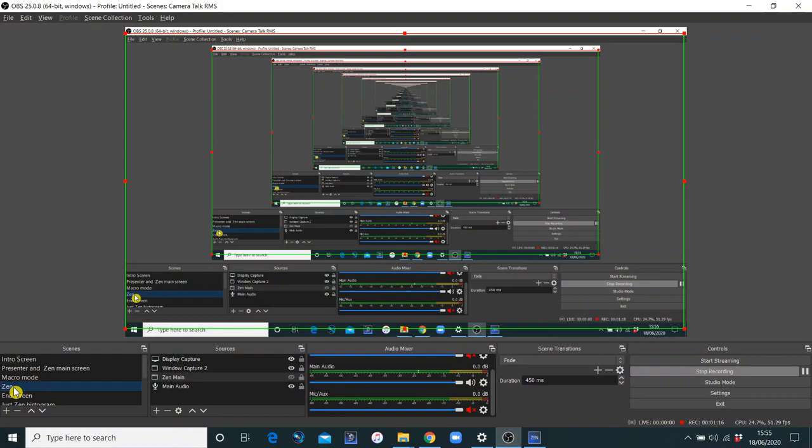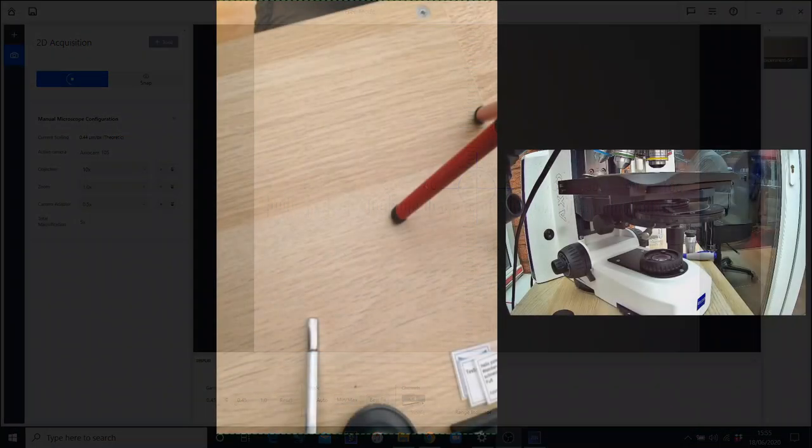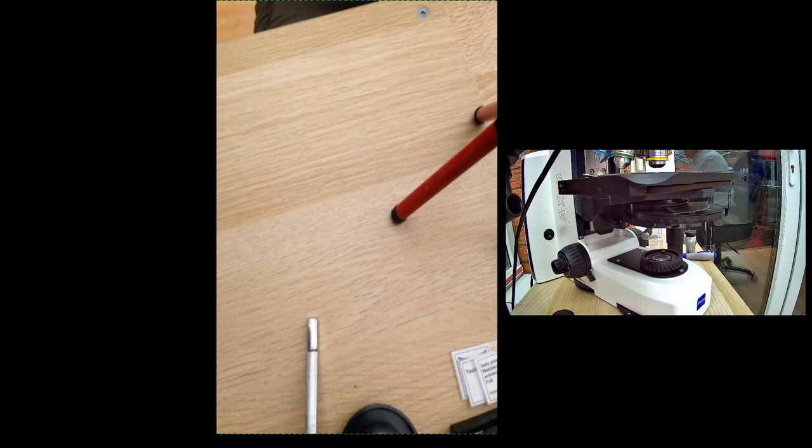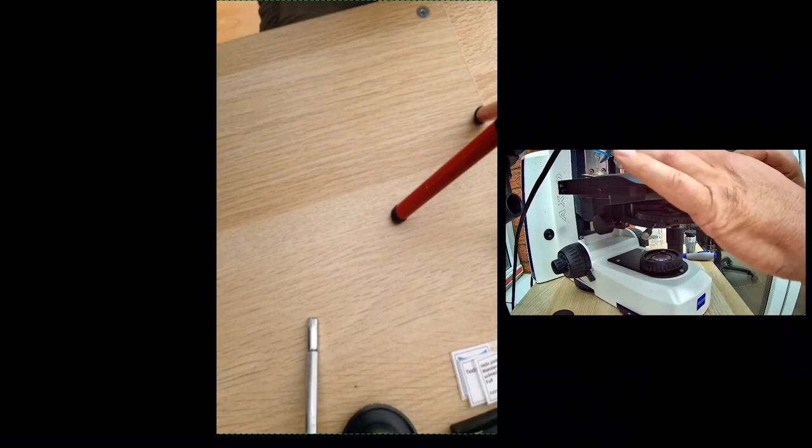Let's have a look at the image. So here's a typical image with a Graticule Zencore. Let me just explain what we've got going on here. We've got a stage micrometer.